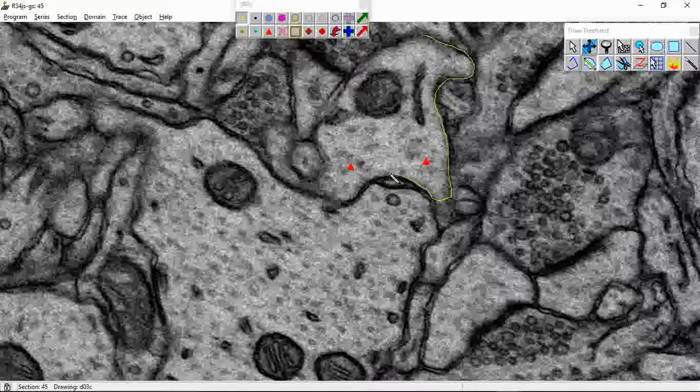So as I continue doing my trace, the second protrusion has come into view, so I'm going to include that. I'm not going to trace that entire protrusion just for time's sake, but on an assignment or working with actual experimental tissue, I would go ahead and trace that spine by scrolling above it and also below it, because sometimes you'll come upon a protrusion that will seem like it attaches to the dendritic shaft and then goes away and does not do anything as you keep scrolling up.